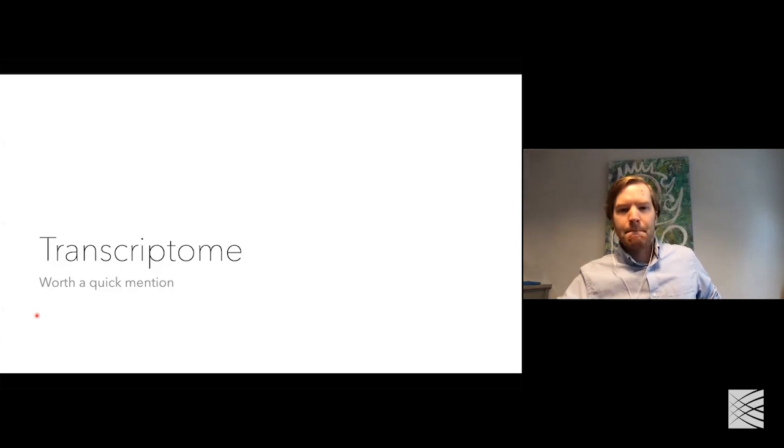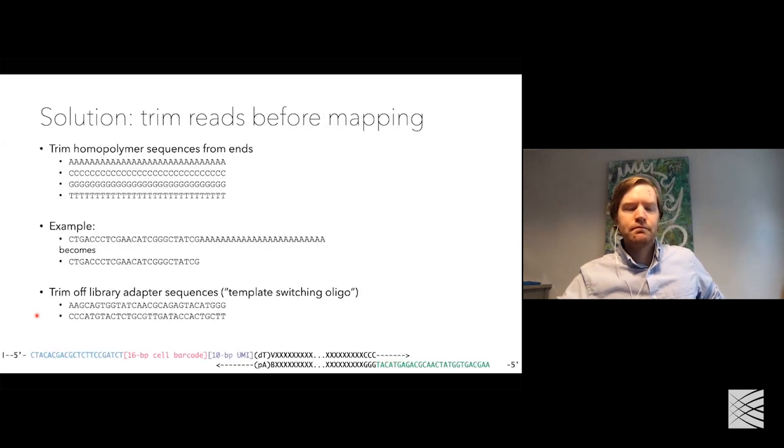Thank you. And there are multiple questions about trimming. So I will try to summarize them into one question so that you can continue the next part of your talk. But so what is your sense of why most people or many people opt not to trim? Is there a minimum length of sequence after trimming that you keep? And do you have any preferred methods for additional trimming, either as one might use for bulk RNA, or are there any that are special for single cell work?